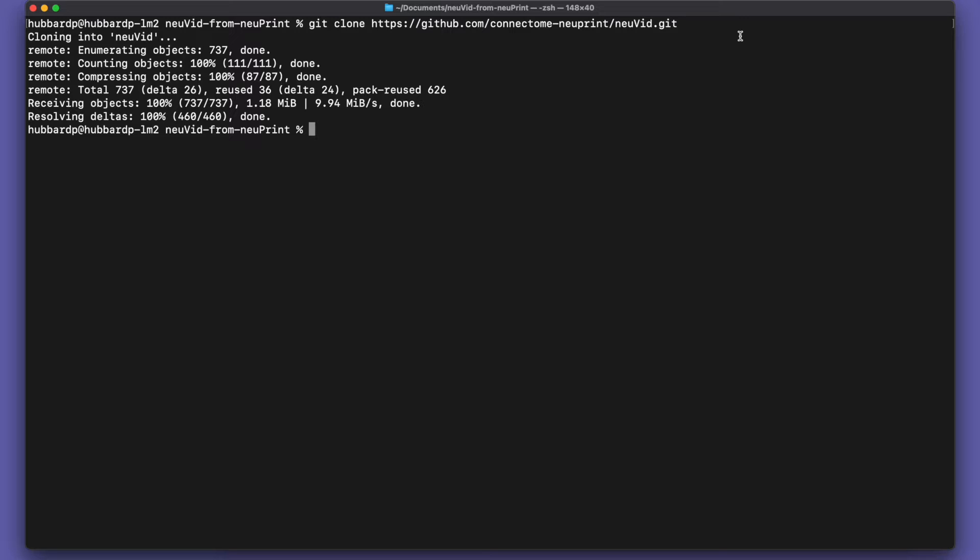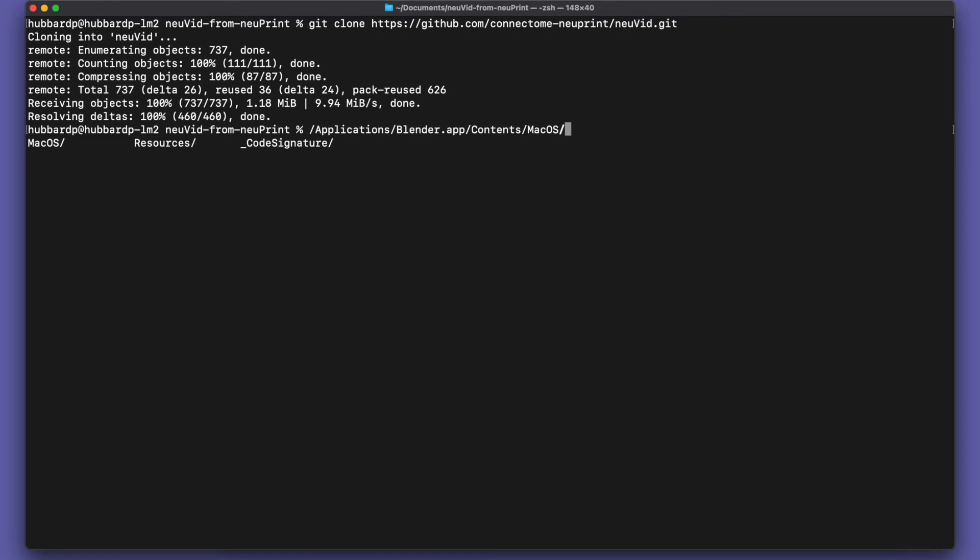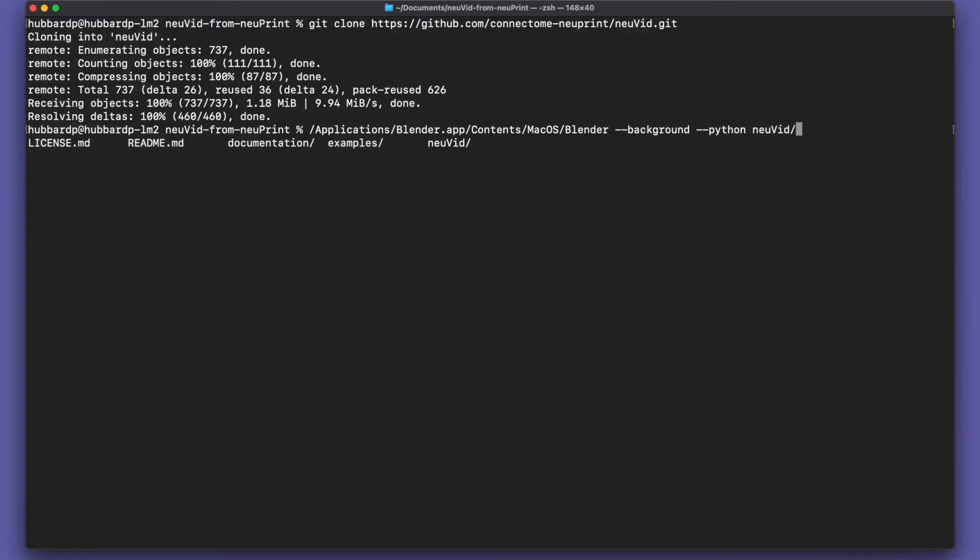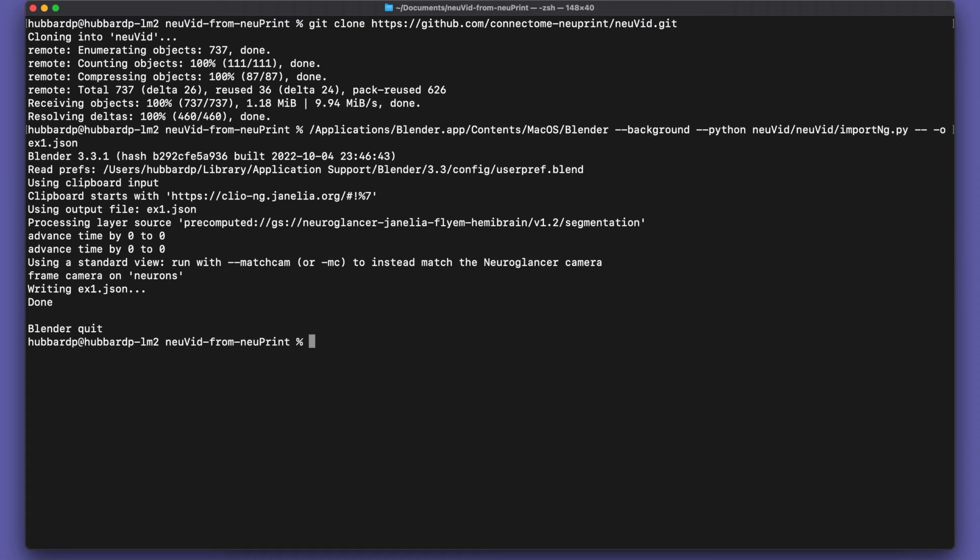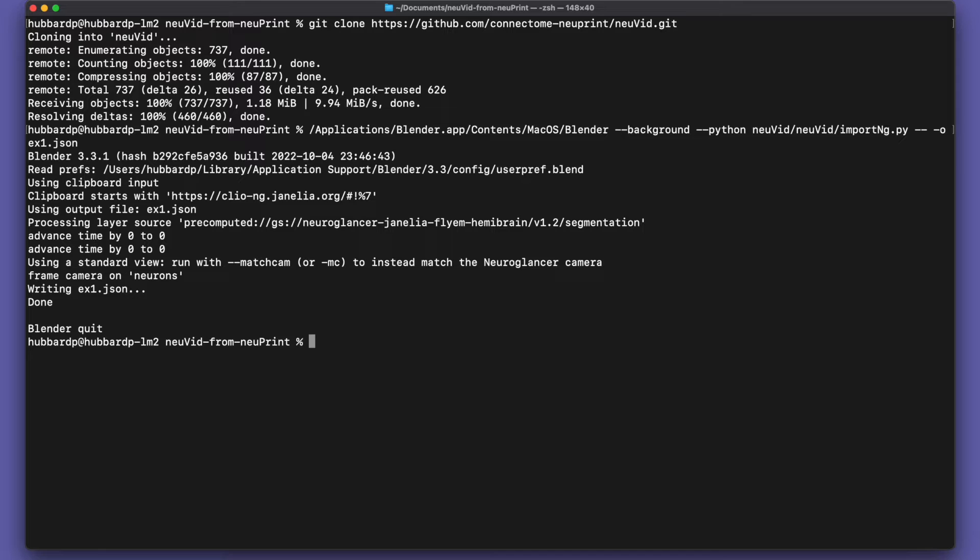So we come back to the shell. We run Blender. And we run it in the background. So instead of having a user interface, it runs this Python script. And we do two dashes here, and then say we want to output it to example1.json. Now that's going to take the NeuroGlancer information from the clipboard and process it into a JSON file that we'll use to control the rest of the video generation.